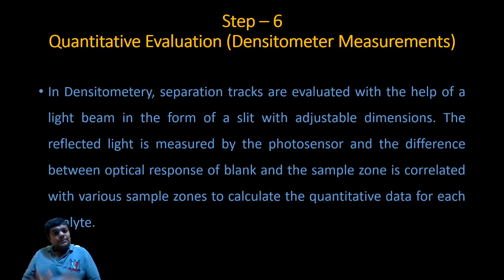So friends, if you go through any natural product research paper, people have today with the help of HPTLC reached a level where they can say that in so and so plant there are 8 different components obtained, and each component or each flavonoid or each different natural product is in so and so quantity per ml of extract. This is the magic of high performance thin layer chromatography.